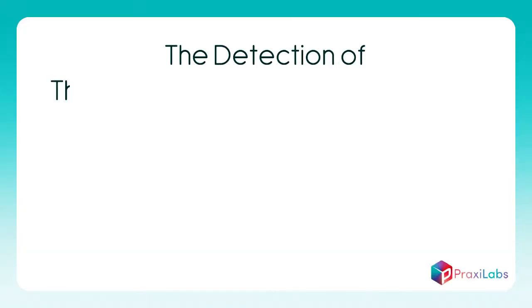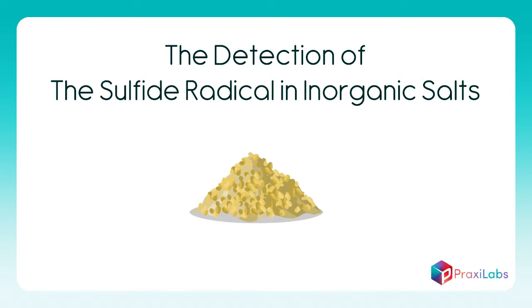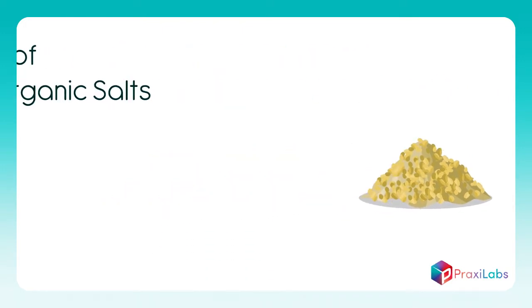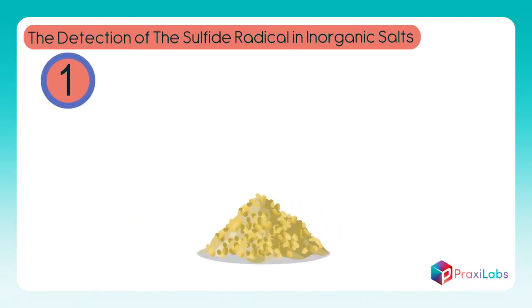The detection of the sulfide radical in inorganic salts. Choose sodium sulfide salt from the salts menu.